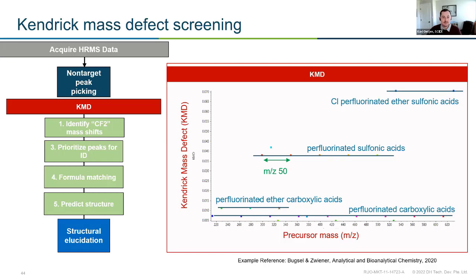And it also gives me a little bit of information, right? If I know one of the compound's identity in this series, well, I can go ahead and identify the other ones because we're just talking about that mass shift of CF2. So again, you get sort of this really nice reward for just knowing one structure, and all of a sudden you know 5 or 6, and you can move up the pyramid really quickly.